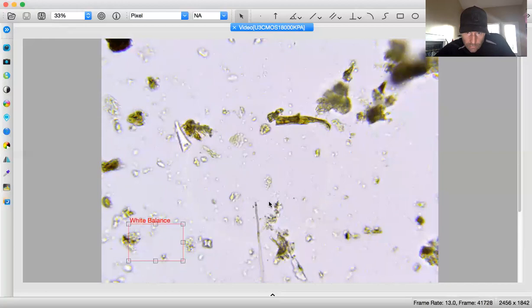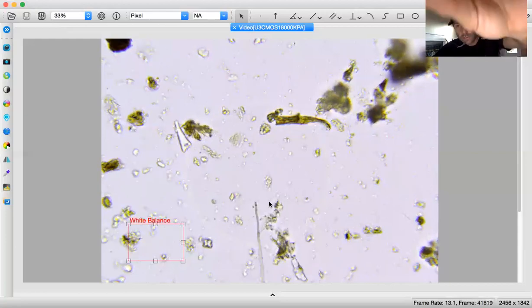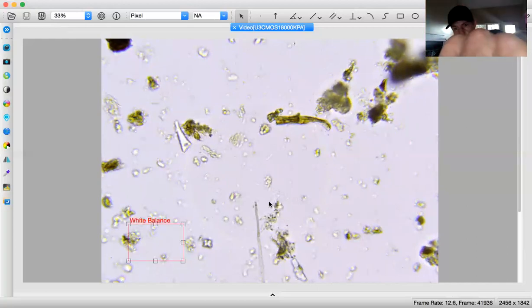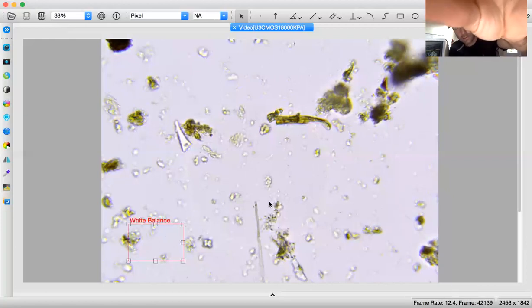Well, that's an interesting organism. Like a crazy bacteria moving through. Well, there's a big old string of actino. I got 1.5 on top. 2, 3.5, and then 4, 5.5. So I'm gonna call that a 6. That's a straight up 0.6. Yeah, I mean, actually one.